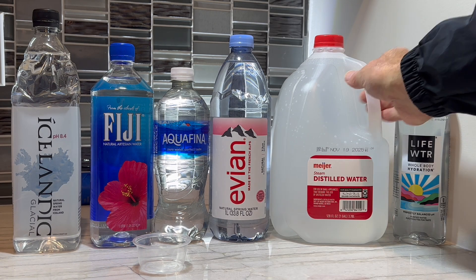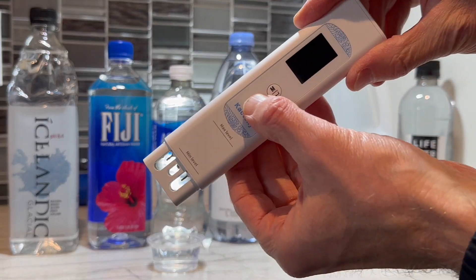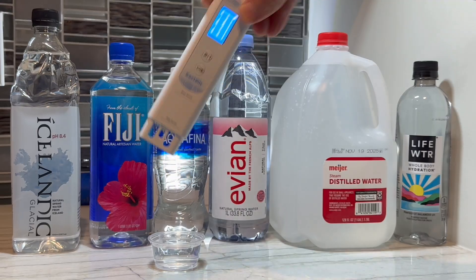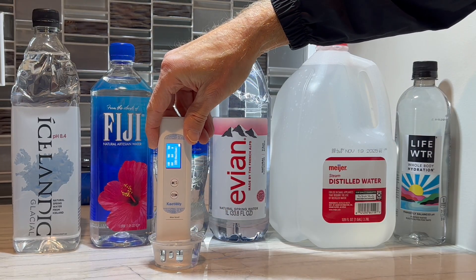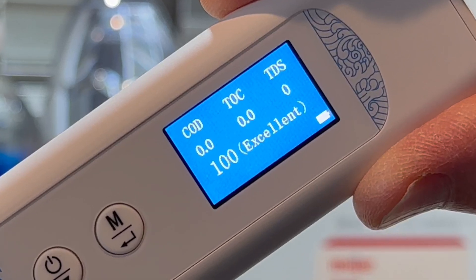Okay, to start with, we're going to use distilled water. This is generally the most pure type of water that people can easily get their hands on. Let's power up the device, test the water, and check out the results. This is exactly what I would expect for distilled water — all three measurements register zero.